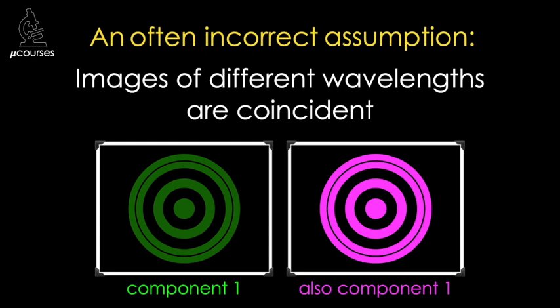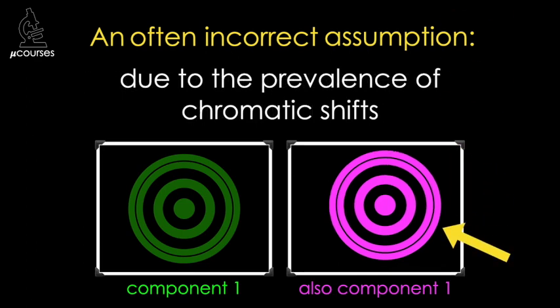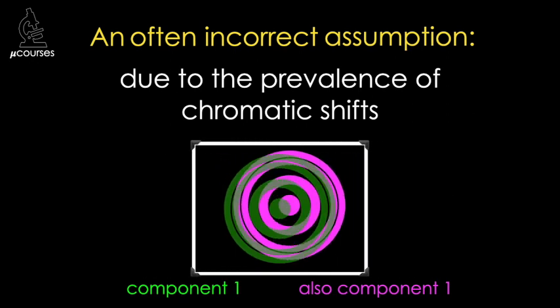Chromatic shifts result when images of different wavelengths of light are shifted relative to one another, such that the merged image of the specimen does not accurately represent the reality of the specimen. Appreciate the possible misinterpretations of imaging data that chromatic shifts may result in, particularly with co-localization measurements. The simple translation of one image relative to another, as I've shown here, is the type I will address in this microcourse, though more complicated misregistrations are possible as well.